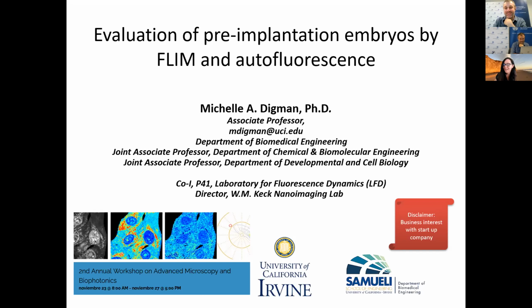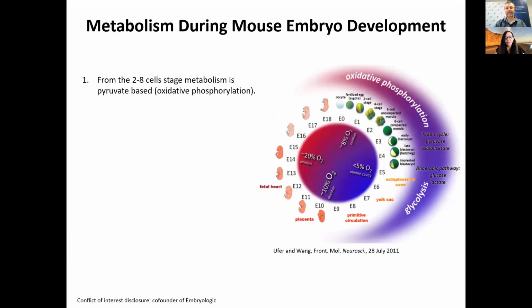I'm really excited to talk to you about this work that we've been working on at the LFD and show you some of the FLIM applications. And FLIM, of course, you've been learning throughout the workshop. So this project actually began as a curiosity in terms of trying to understand if we could develop a way to look at fluorescence lifetime fingerprints of the developing embryo.